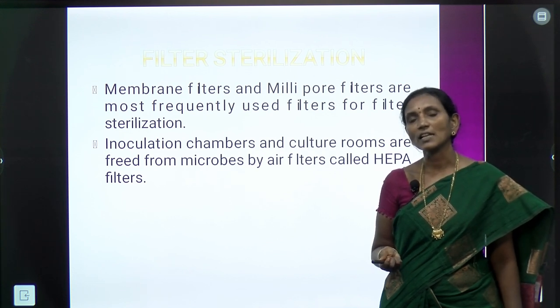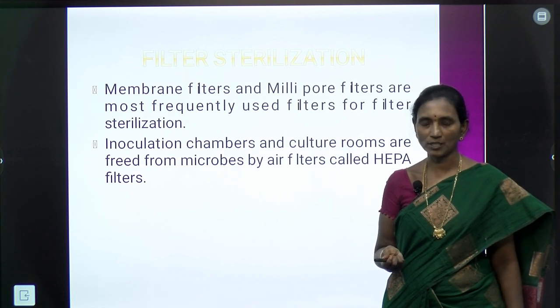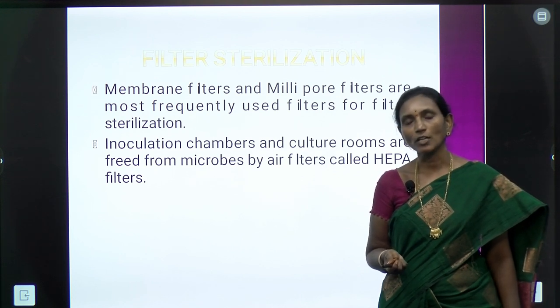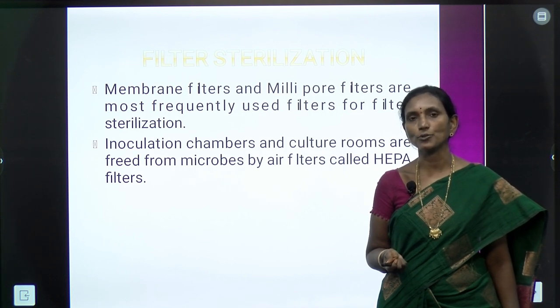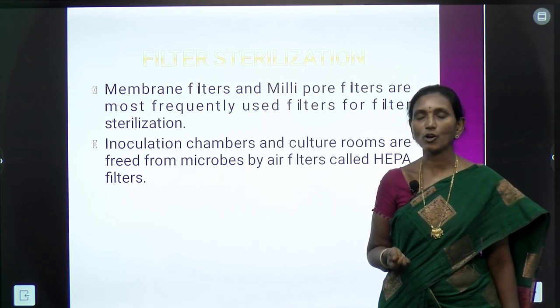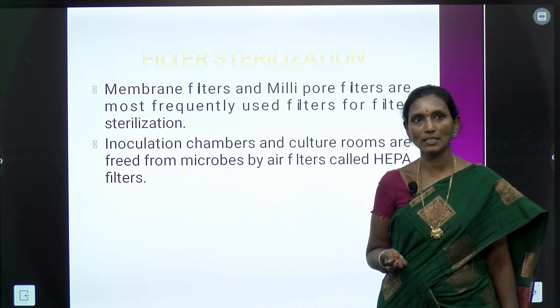Here, filter sterilization is used to filter the air from the microbes because, as you all know, microbes are abundantly present in the air. So, during inoculation, there may be a chance of infection of the plant tissues. Therefore, inoculation, that is the transfer of sterilized explant onto the sterilized nutrient medium, must be done under aseptic conditions.